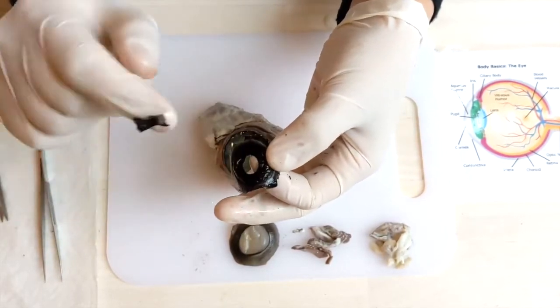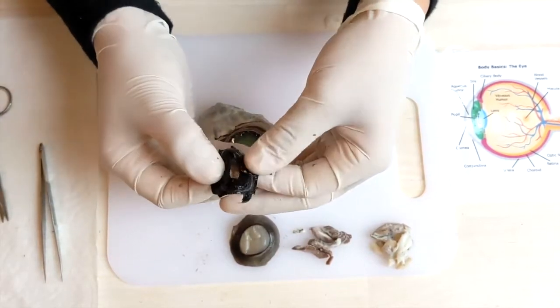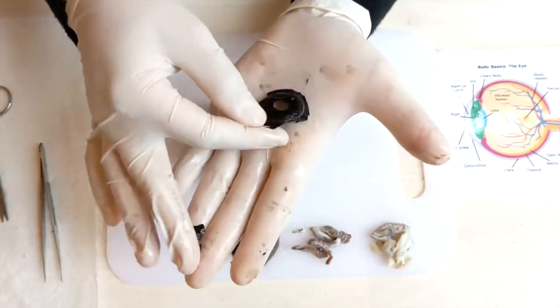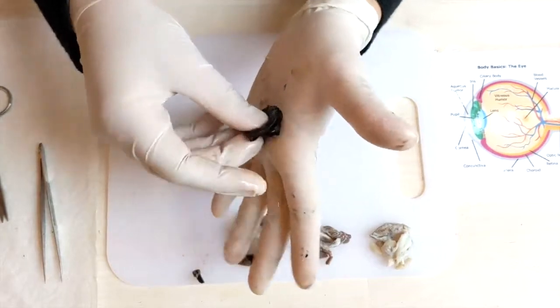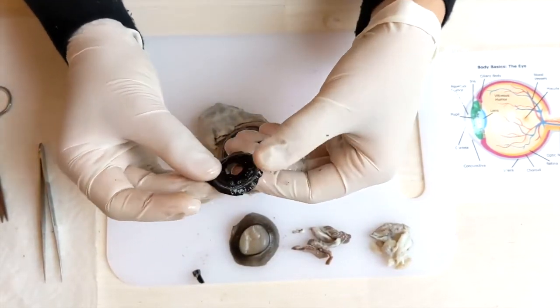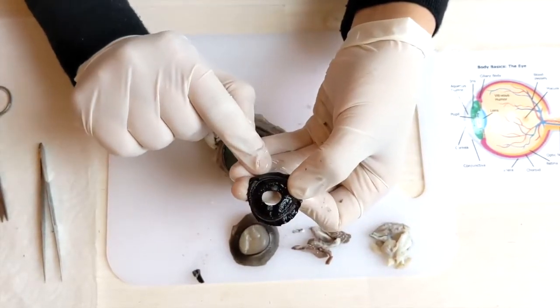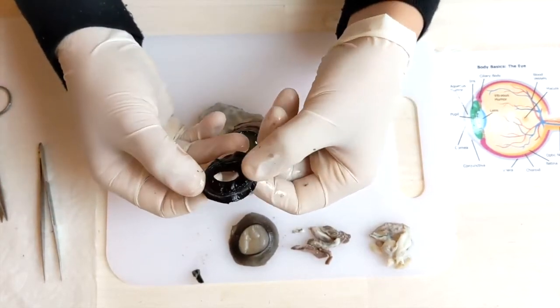And if there's a lot of light around you, what happens? It gets smaller. Exactly, smaller. So it allows less light to enter your eye. Hold your questions till the end, please. So what shape is the pupil here? Oval. You remember, this is also a second difference between a cow's eye and a human's eye. A human's eye has a circular pupil, but a cow eye has an oval pupil.